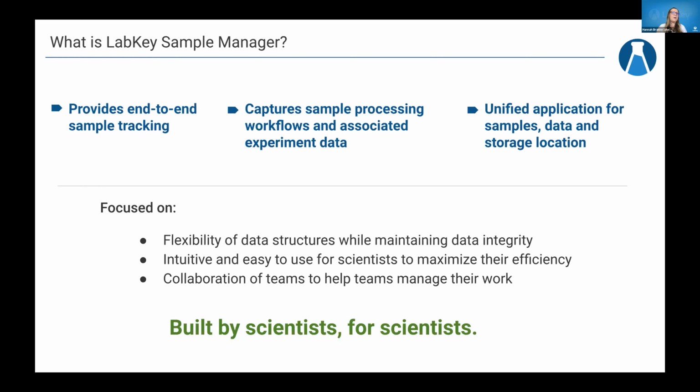And following that, being in the lab myself for a long time before I came to this, and seeing how hard it was for people to use external tools, we really wanted to make something that was intuitive for teams to use, as well as really, really easy to use and pick up. So people would be excited about using them, and then hopefully maximize that efficiency by having that data integrity and being able to use it in their day-to-day workflow.